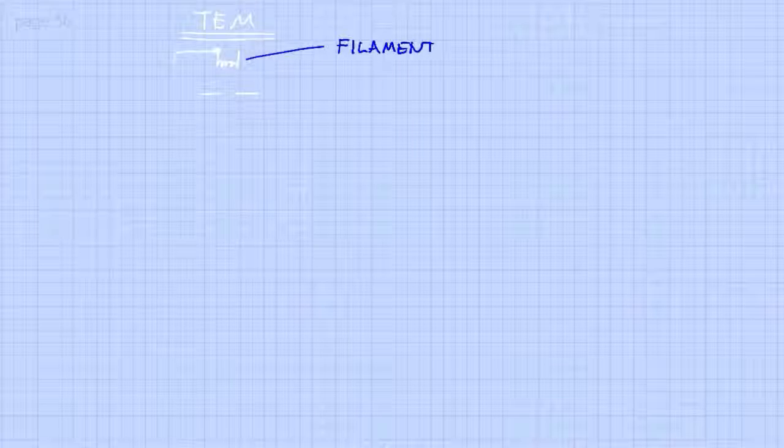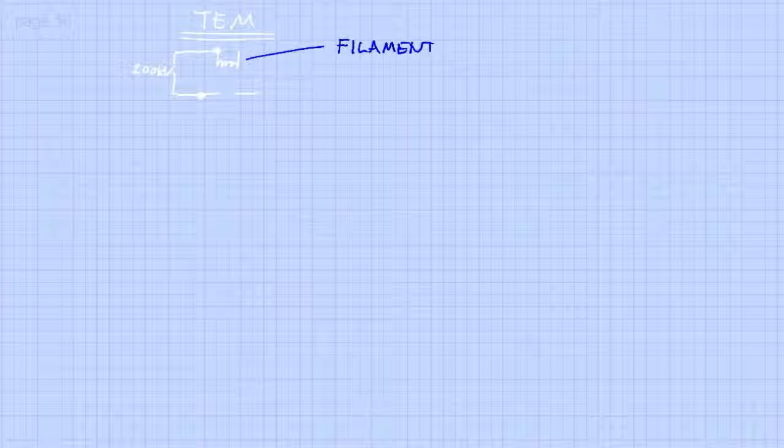So here I will draw an overview of the column in the microscope. At the top we have the filament and the gun. The filament emits the electrons, and the gun is basically an electrostatic potential that accelerates the electrons and shoots them at the sample. In the transmission electron microscope, voltages up to 200–300,000 volts are possible.